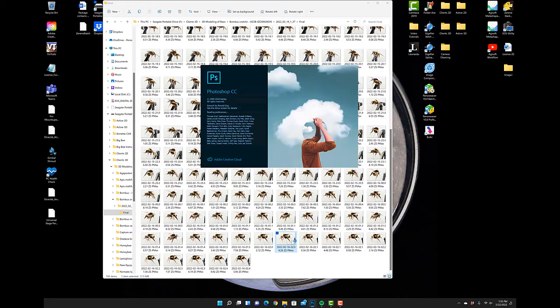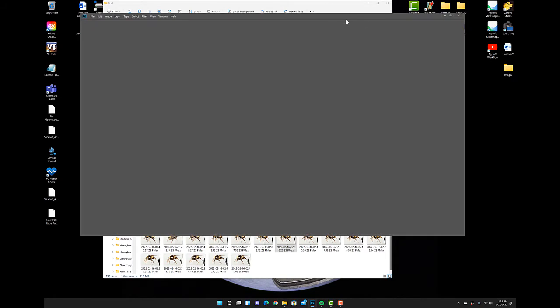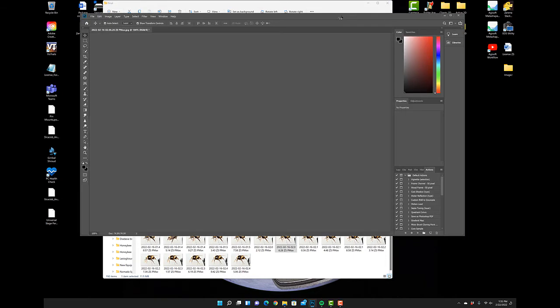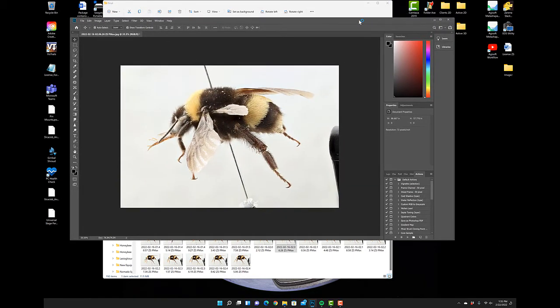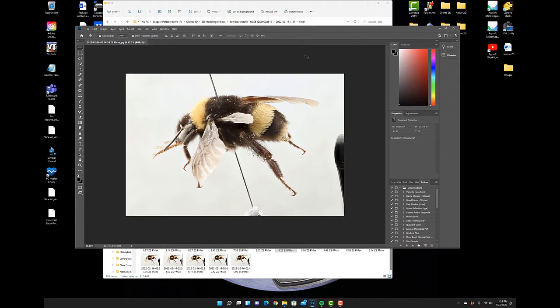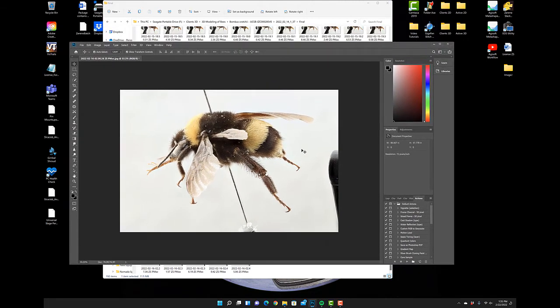And one thing that might be really good to do for scaling is just to add a scale bar to one of these images and save it in an external folder in case you ever need that information later. So Agisoft Metashape, aside from just building 3D models, also allows you to do very sophisticated volumetric measurements. And in that case, you do need a scale bar. So we know that we shot this image at 1x magnification on the MPE 65mm.